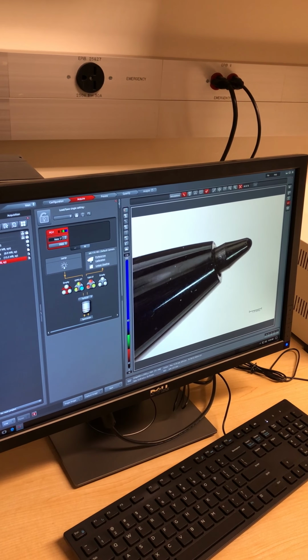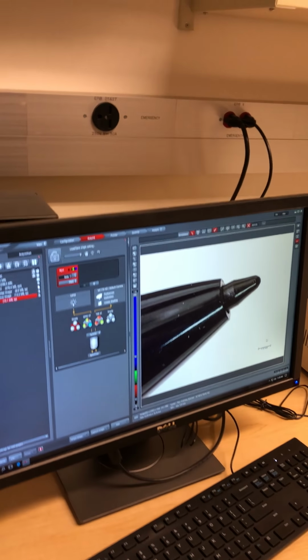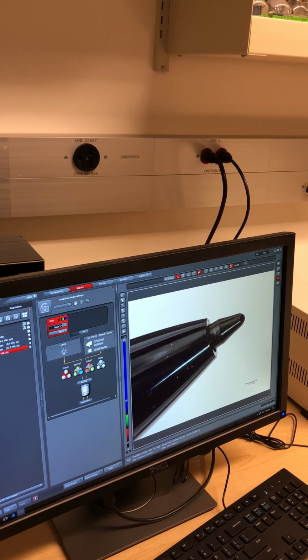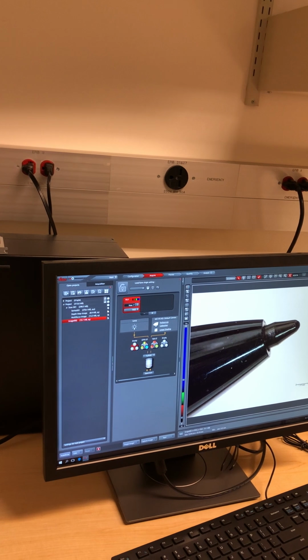Now, if you're doing figures, I always do mine in Photoshop. I always have a thing that's saved. But you do want to have one at least with the scale bar, like a 10 micron bar, whatever. So what I would do is just have one in one of the images, and then you can just draw your line and do it in Photoshop. That makes sense. Yeah, and it'll be with it when it's exported.